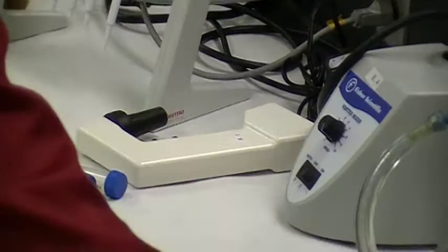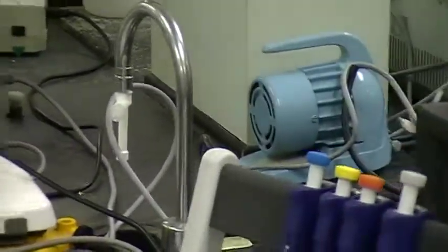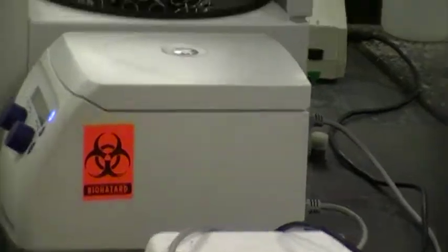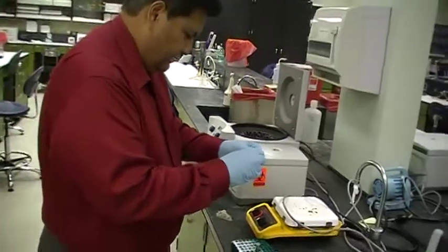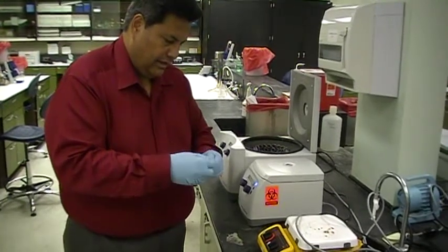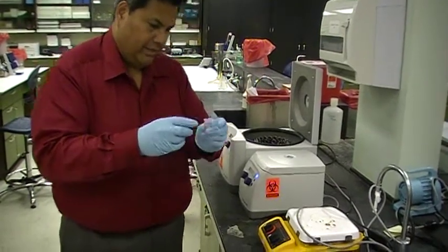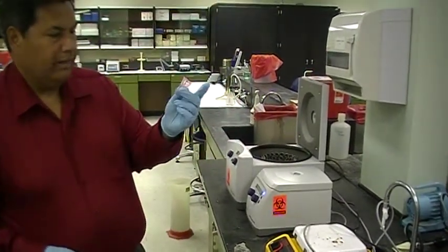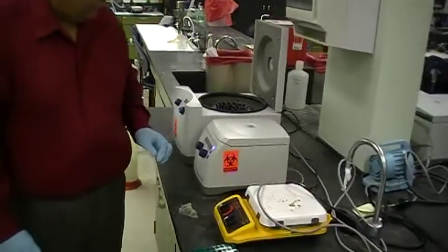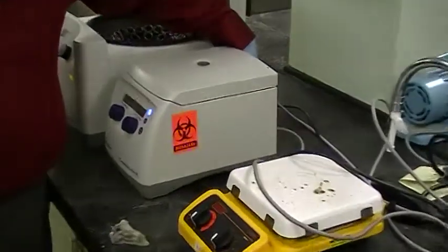Now I'm going to move over and show you how to use the next size up — the larger microcentrifuge. You always use this in balance. You have two tubes that are basically balanced. Let's say I want to pellet these tubes, so that I get a pellet on the bottom. You turn the microcentrifuge on using the switch on the back.